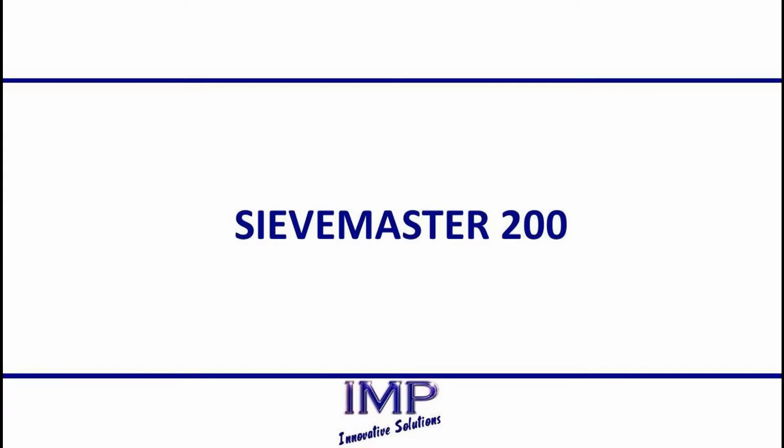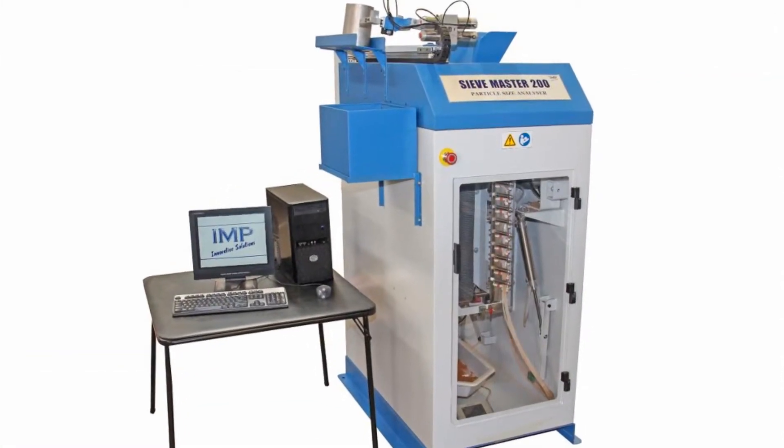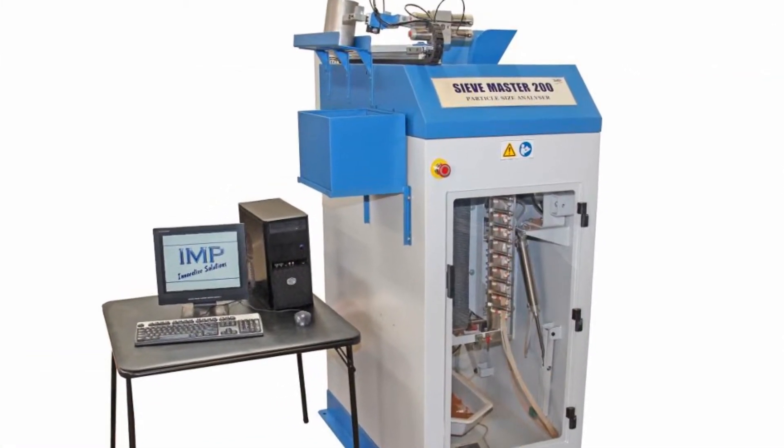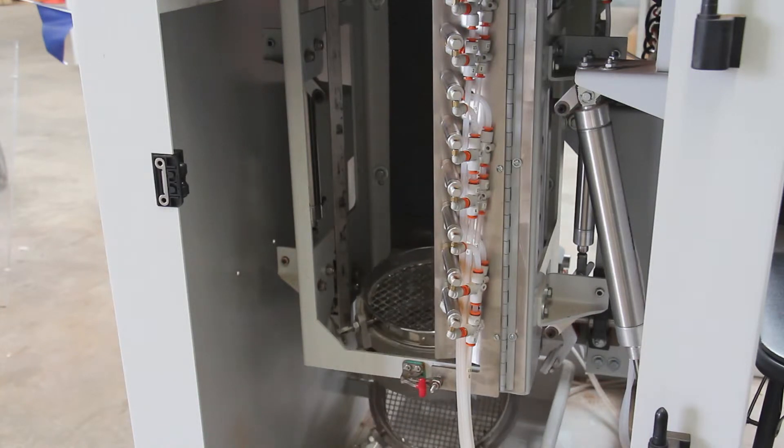The IMP Sievemaster 200 is the economical and smart solution to sample particle size analysis. More than 10 years of in-use experience has demonstrated that the Sievemaster 200 provides consistent and reliable performance with extremely low maintenance.